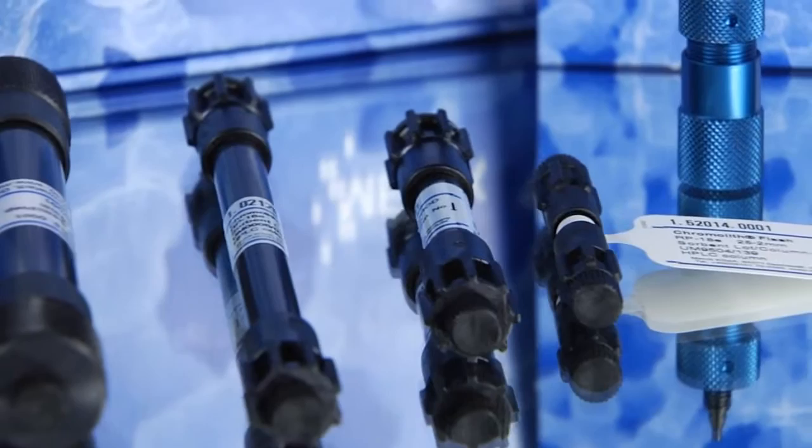We can only satisfy our customers' needs by offering innovative chromatography solutions and products of consistent top quality.